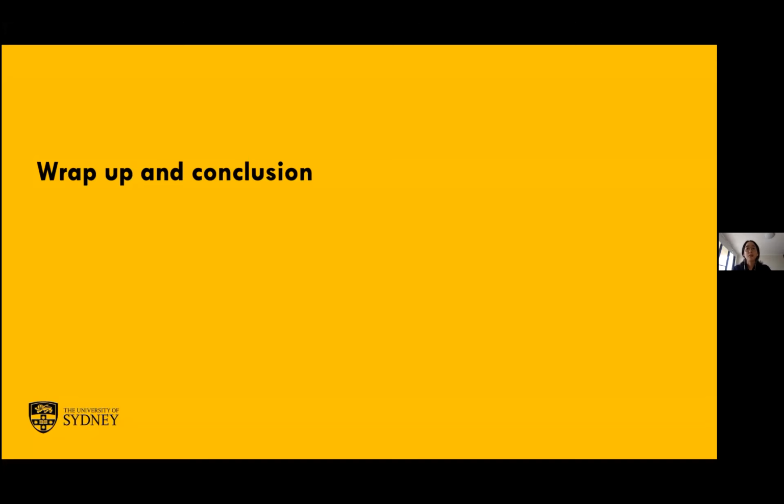Okay, I think we have 5 minutes left. We would be happy to take further questions regarding the code and analysis. We've been having very good questions so far. It would be great if you could also share insights on the experiences you've had with multimodal analysis.